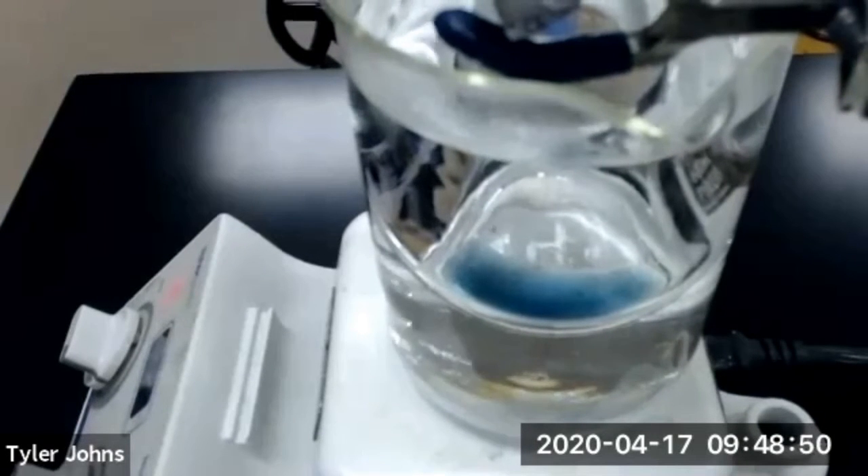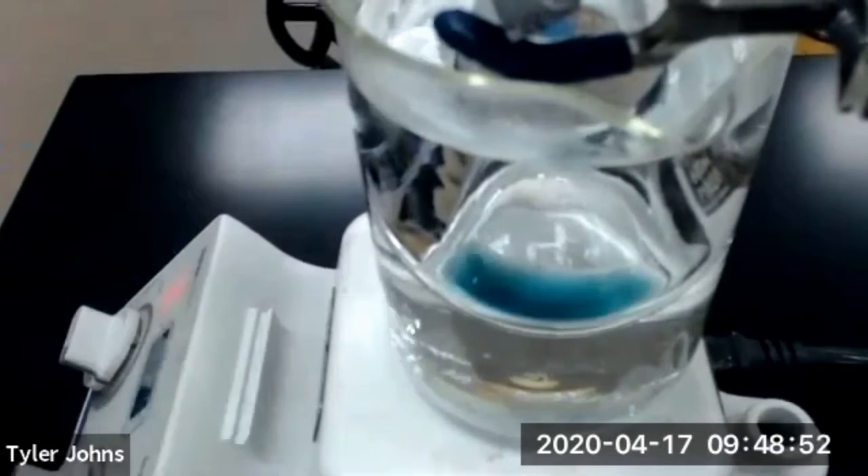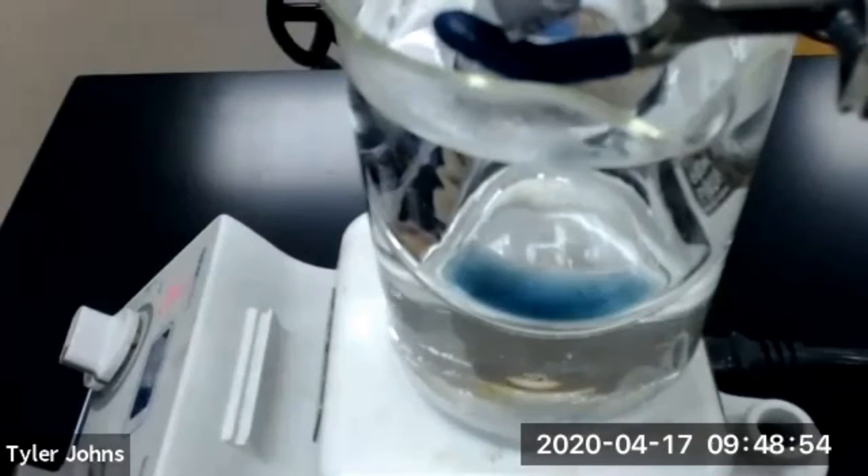Again, that dithiazone dye is going to help us determine exactly when no more volatile liquid is remaining in the Erlenmeyer flask.